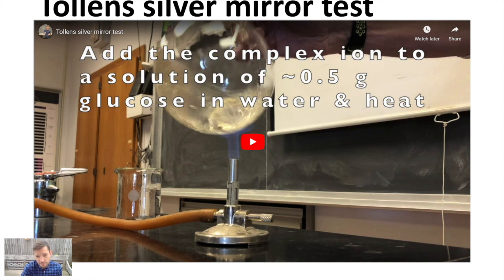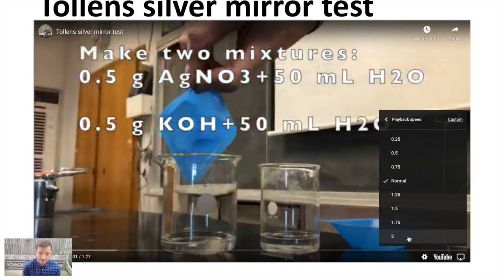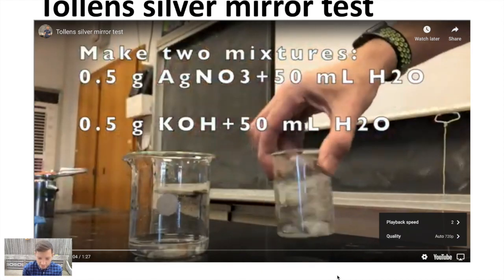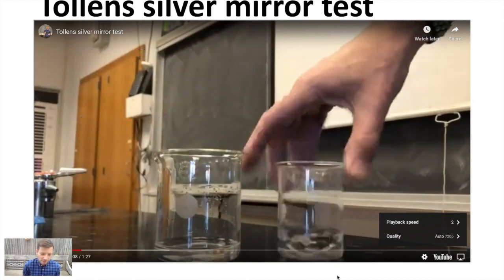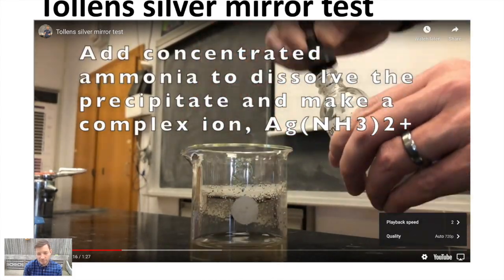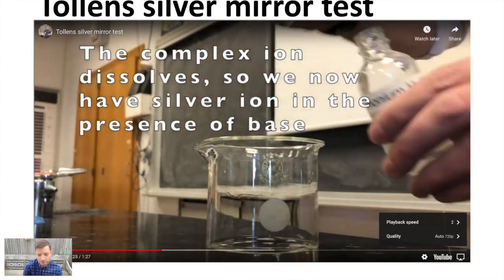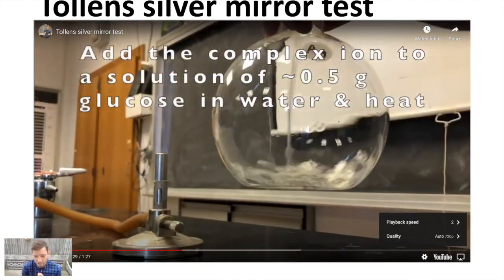I'm going to kick it off with a video from our very own classroom that shows what's called the Tollens silver mirror test. So this is the synthesis of a silver reagent, known as the Tollens reagent. It first involves making silver in solution in the presence of base, and we do that by making what's called a complex ion, a silver ammonia complex ion. So that first part is just making the Tollens reagent.